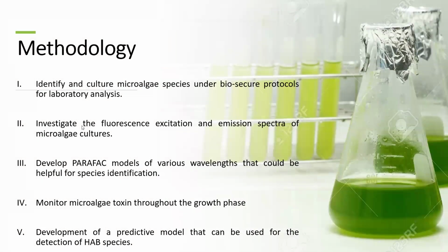So based on these findings, the proposed methodology of my research will be to identify potential algal species that will be purchased and cultured under biosecure protocols for analysis. These cultures will be analyzed using fluorescence spectroscopy to identify various fluorophores, which can be used as a fingerprint for the species. Also, PARAFAC will be used because it is a well-established method for the analysis of excitation emission matrix spectra. It allows for the decomposition of the multi-way data, focuses on the features of interest, and produces a distinctive illustration of the results. It also offers a more in-depth exploration of the extraction of the spectral data information.